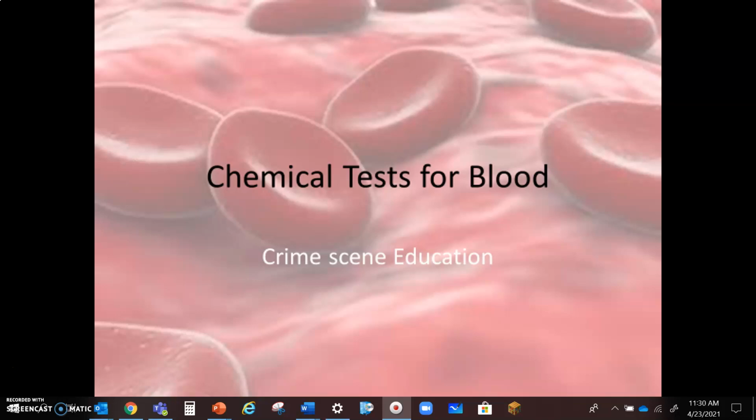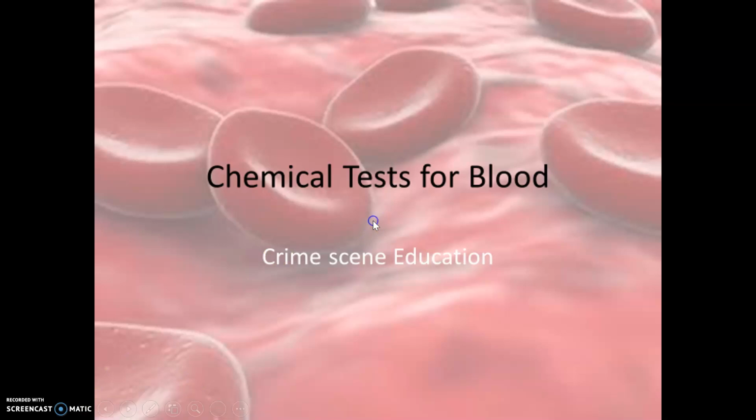Hey guys, so this is going to be part 3 of our notes on the chemical test for blood. This will be the last section of notes. At the end of this section of notes, you're going to have some videos of people going through the process of doing some of these tests. So hopefully you guys can actually see the test done in action. Alright, let's get moving to the information.